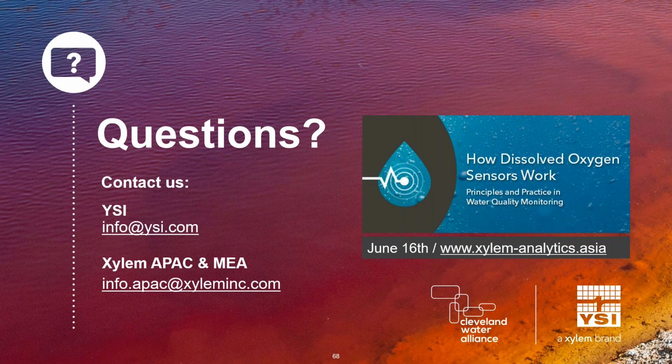Great, thanks, Ben. So in your opinion, should the audience adopt a 2 or 3 point calibration over a 1 point?